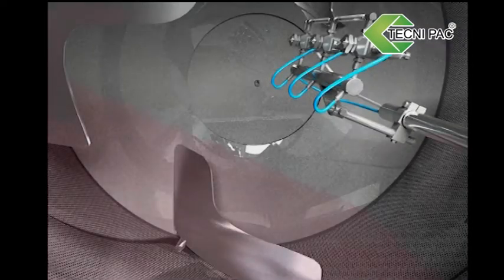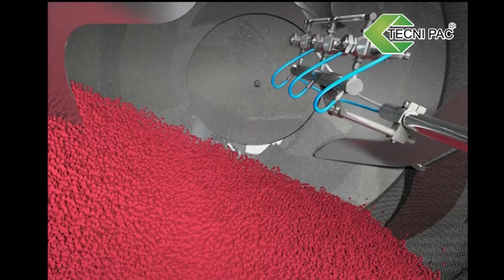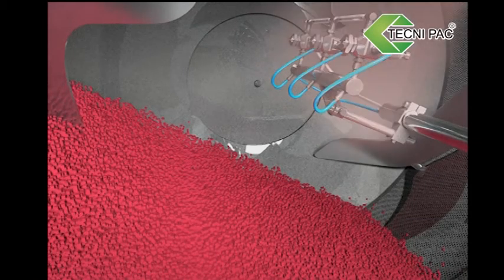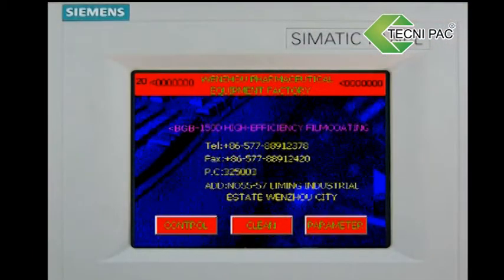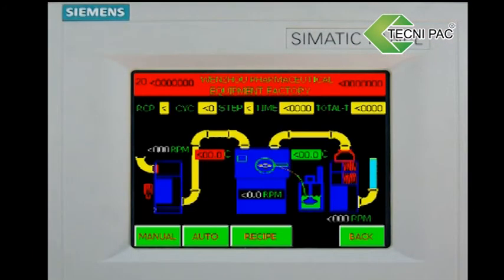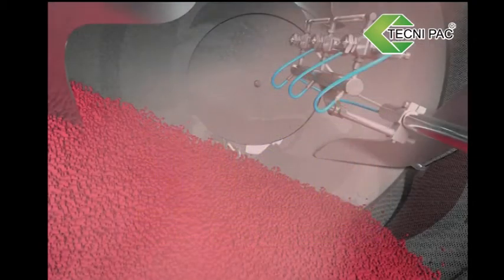Coating Procedure. Each batch is 80 to 130 kg per pan. Tablet Core Preheat: Start hot air and exhaust air, then set the temperature at 60 to 75 degrees Celsius. Preheat tablet temperature at 38 to 42 degrees Celsius.